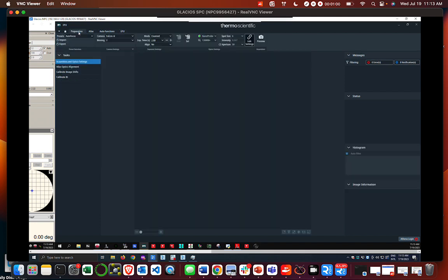So moving back to the preparation tab, what you have is a series of presets that get successively higher in magnification. So we start with the Atlas, which is 115x and has a series of settings associated with that. Grid square, higher magnification. You should only be able to see one grid square at that magnification.